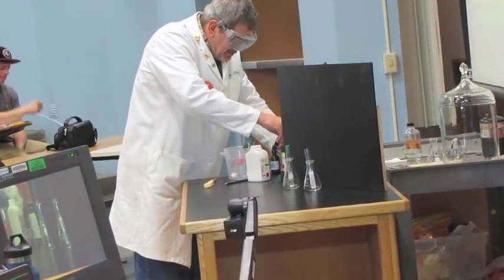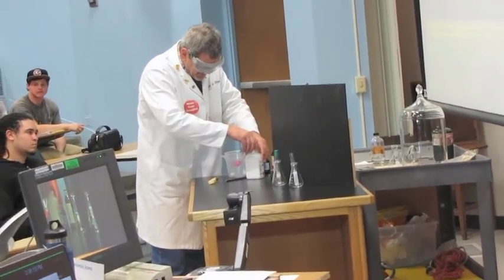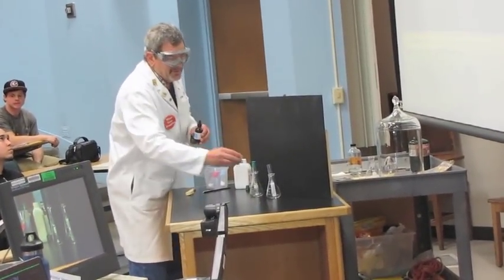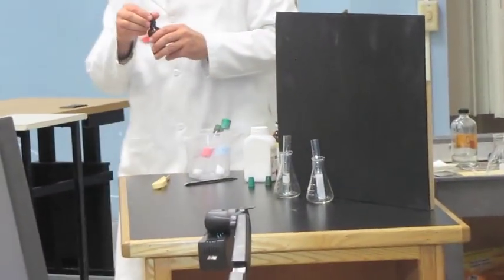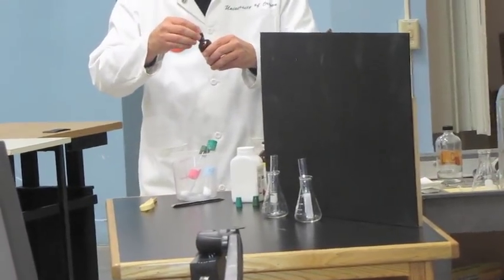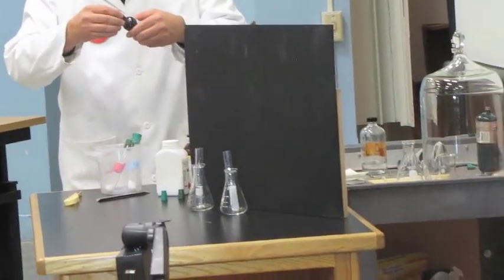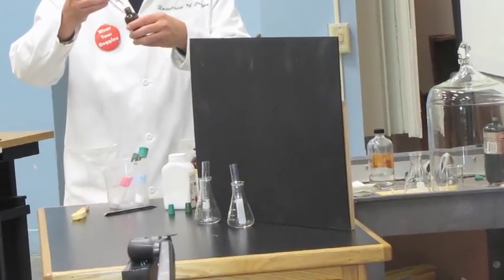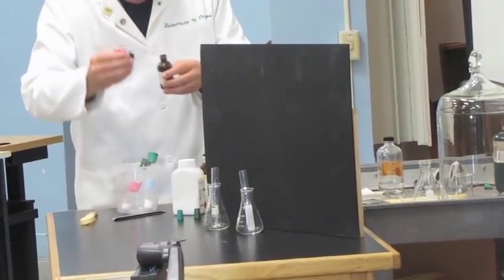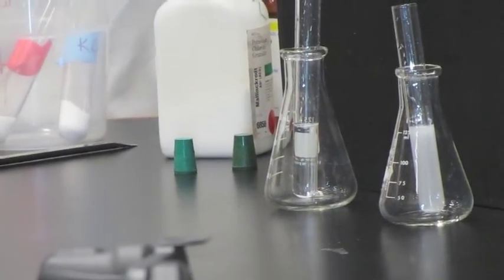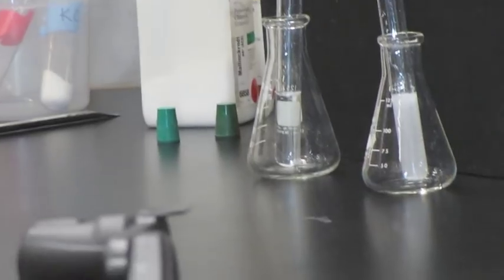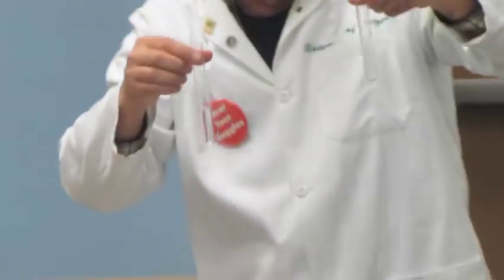Now, let's see if it precipitates with silver nitrate. I'm writing your letters. And not so much. Again, let's, I'll just hold them up. It'll be easier to see. Potassium chloride, we get a precipitate. Potassium chlorate, we don't. That's interesting.